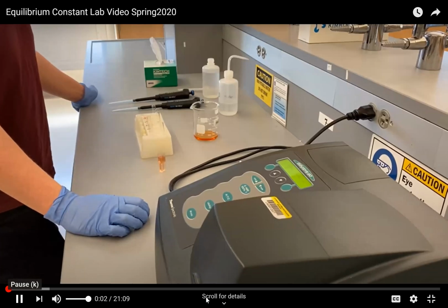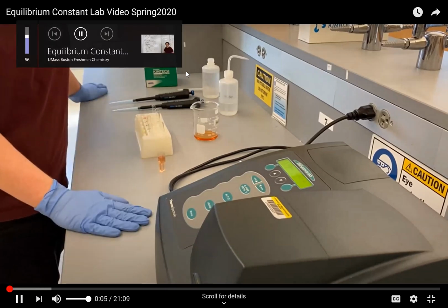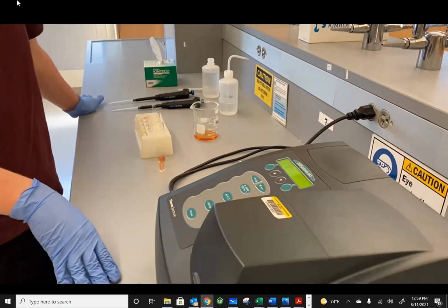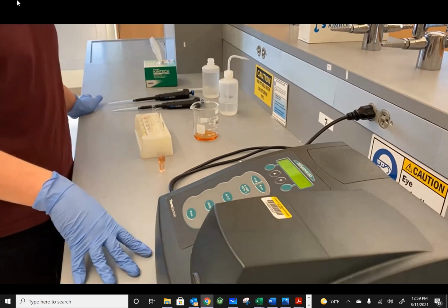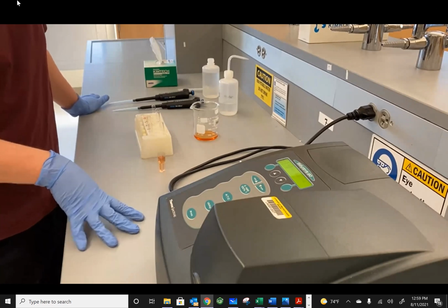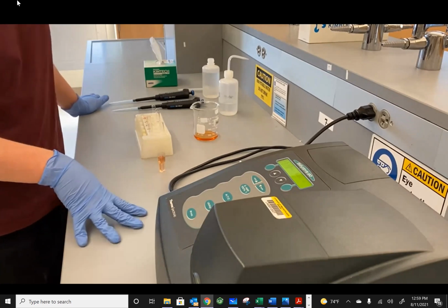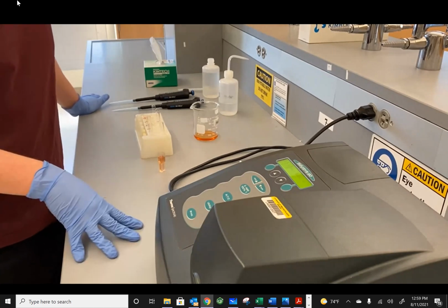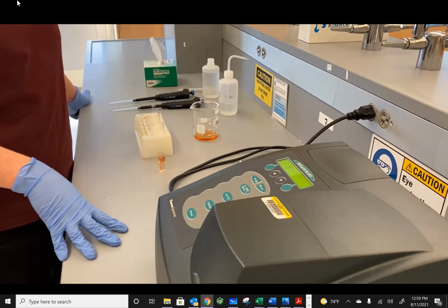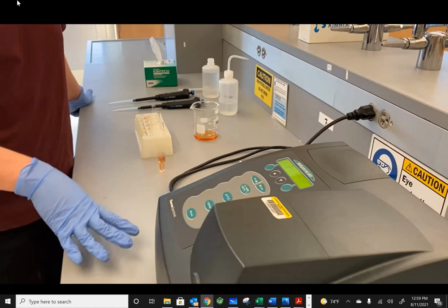All right. This is the Chemistry 118 demonstration video for the experiment entitled Determination of an Equilibrium Constant. The purpose of this experiment is to determine the equilibrium constant of a chemical reaction in which some unknown metal, M, and an unknown ligand, L, come together to form some metal complex. We don't know the exact stoichiometry of that complex, and therefore we don't know the exact stoichiometry of the chemical equation, but we have 2 different hypotheses. Today we're going to figure out which hypothesis is correct.